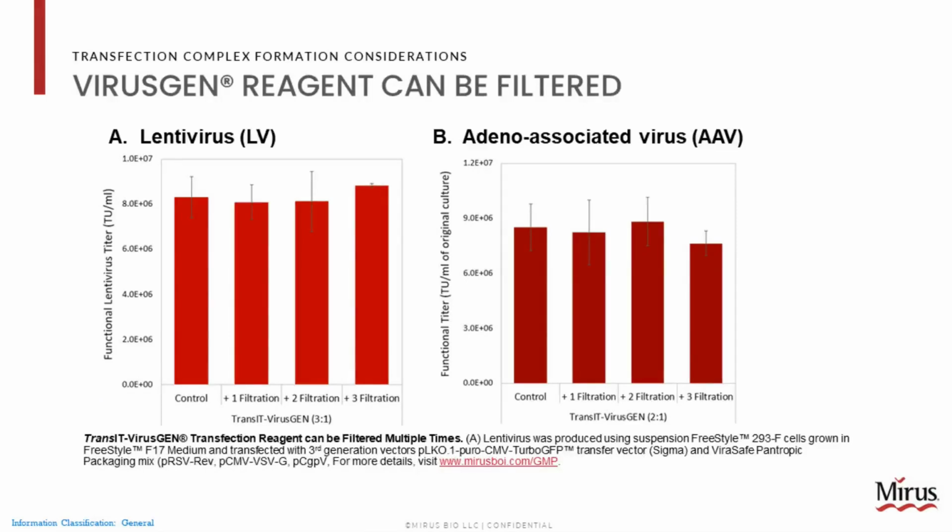So for a viral vector process, our complex tends to be 1 to 4 plasmids, VirusGen, and our formation solution. That can be our media, phosphate buffered saline, or our complex formation solution. And as we get those individual components into one bag or mixing operation to make that complex, we're going to probably need to filter sterilize one or more of these components. And the good news here is VirusGen can be filter sterilized multiple times without any issue.